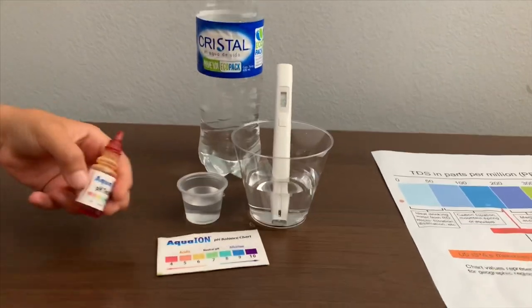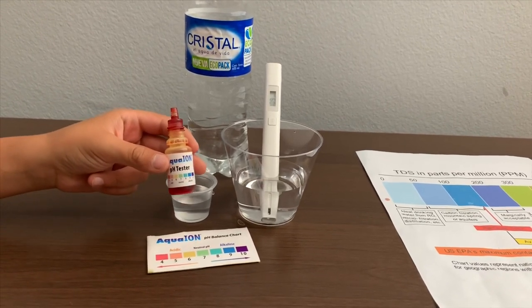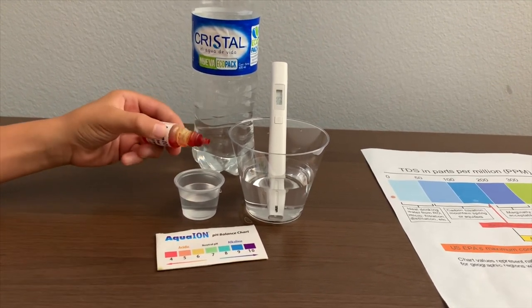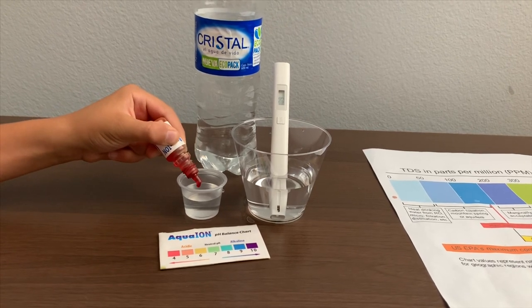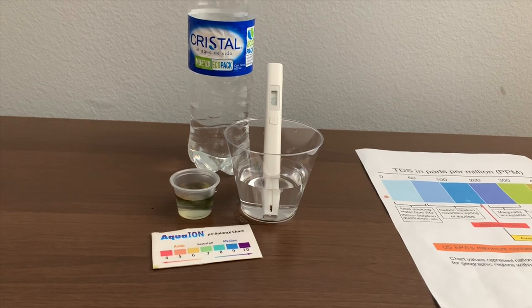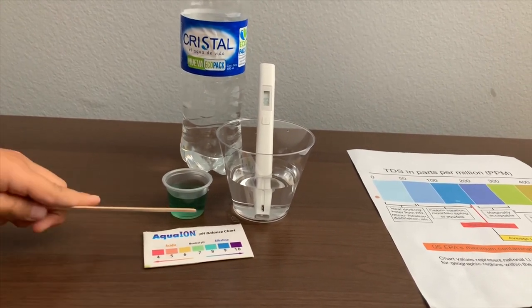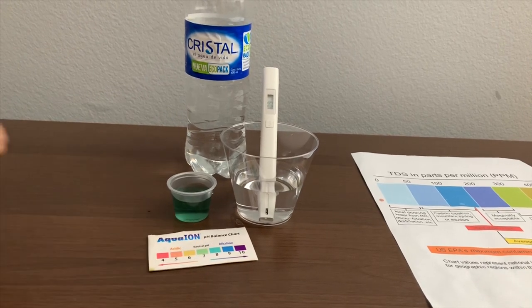Now let's test the pH level. If you want to buy this pH tester, check the link down below. Only do two drops. Let's stir it a little for a better result. I give this an eight. This is alkaline water.